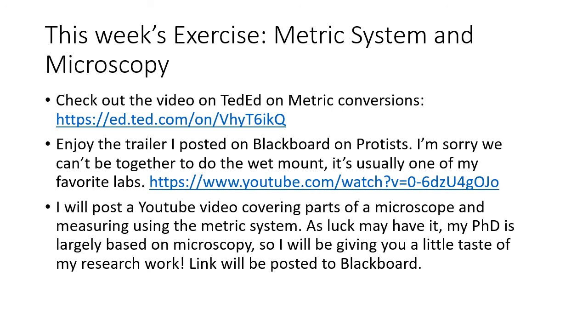As I did before, I'm going to post the questions that you need to do in the lab sections, but really just use basic common sense. If it's data that you would have had to gather in the lab, I know that you're not going to be able to collect it, and I'm not going to be grading that. So I really just want you to focus on the conceptual things. Learn the parts of the microscope, learn the vocabulary, learn how to do the conversions, and we'll get through it.